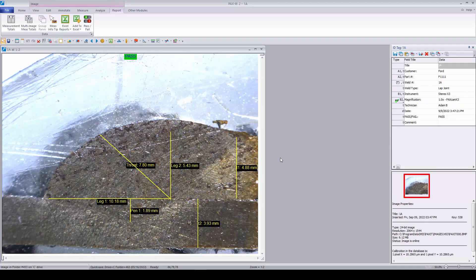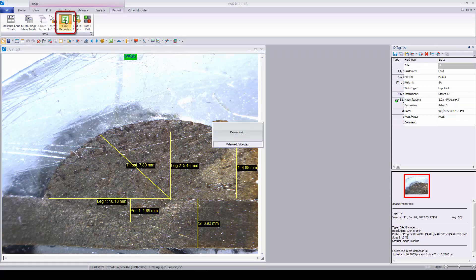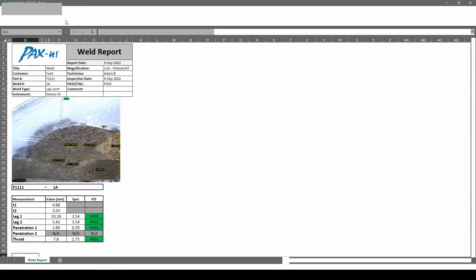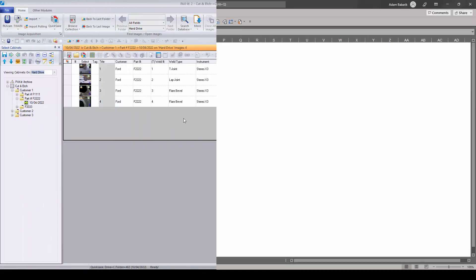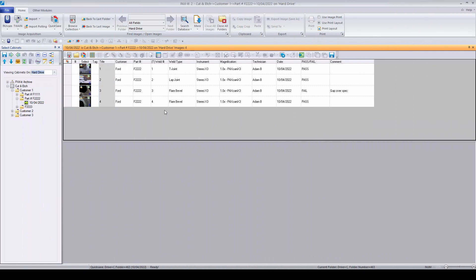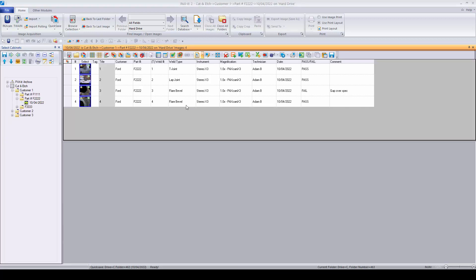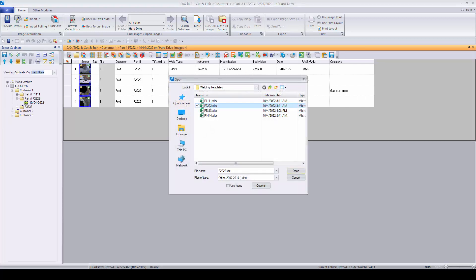Once measured, images are ready to be reported. With the click of a button, Paxit sends all relevant data to the most recently used Excel template for instant report generation. Reports containing more than one image are generated from within a Paxit folder — simply select the images, choose the appropriate template, and all data goes over in the same fashion.